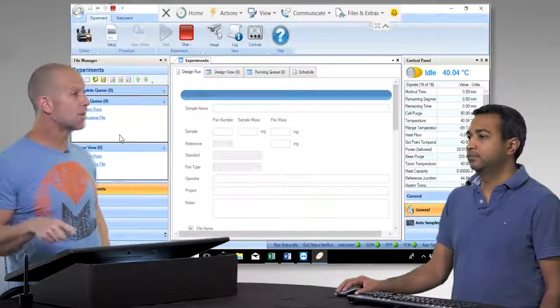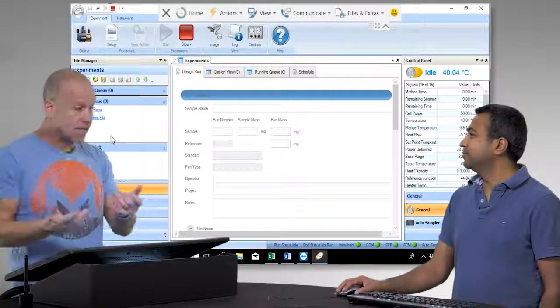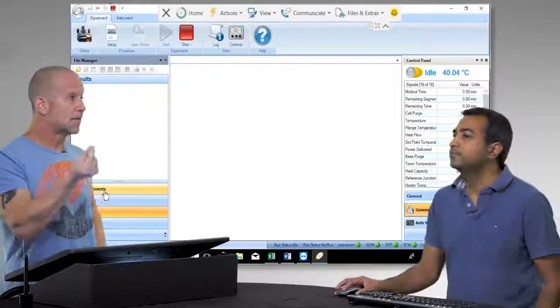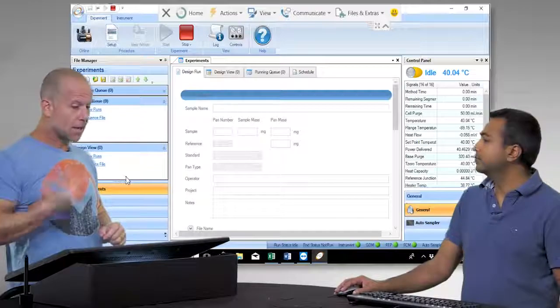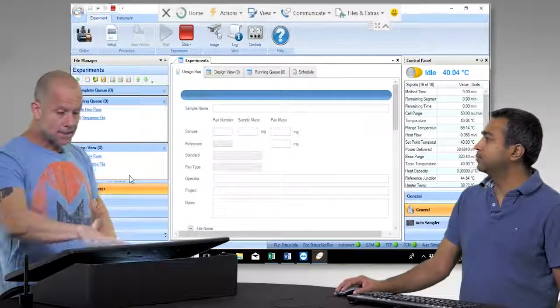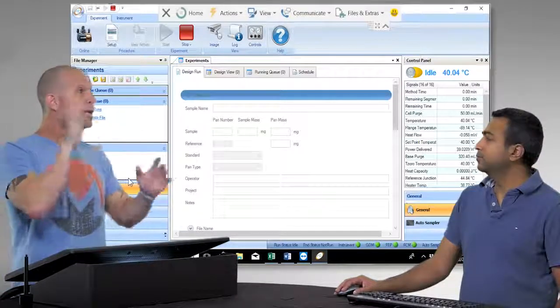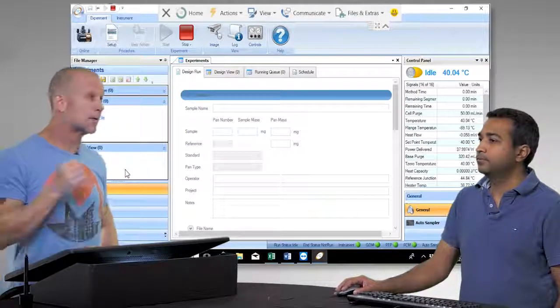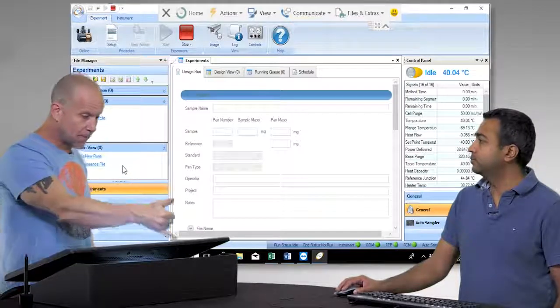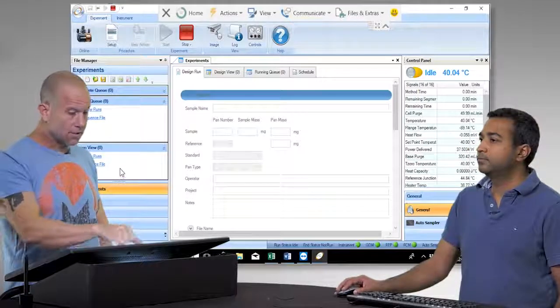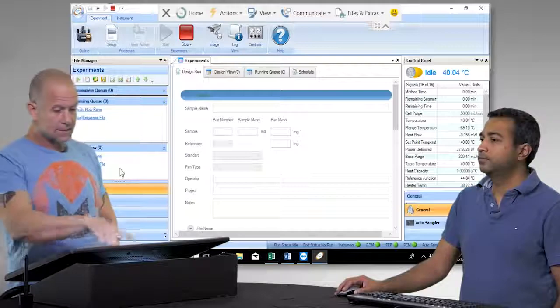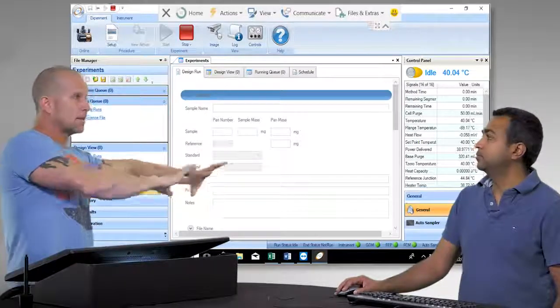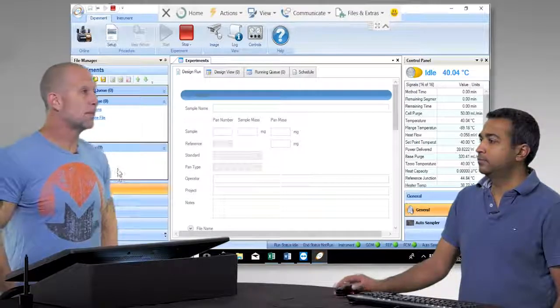Sometimes there'll be something in the run queue, or things might even be running. But keep in mind, you can set up experiments by putting them into the auto sampler slot and creating a design and adding it to the queue, even if something is already running on the instrument. We're going to show it from scratch, but even if there are experiments running through the queue, you can add your experiment at any time.